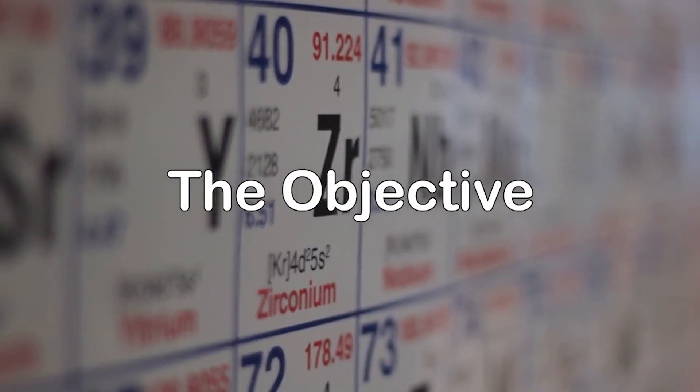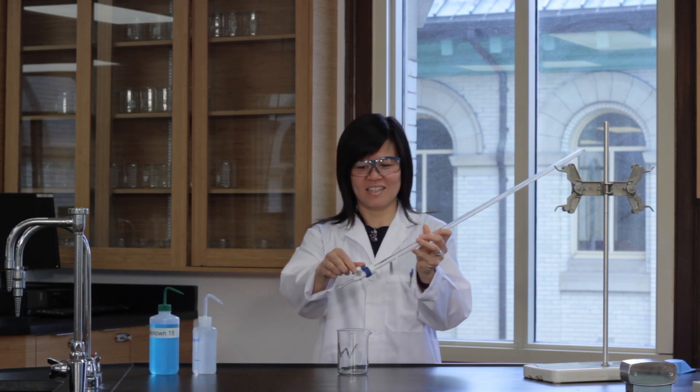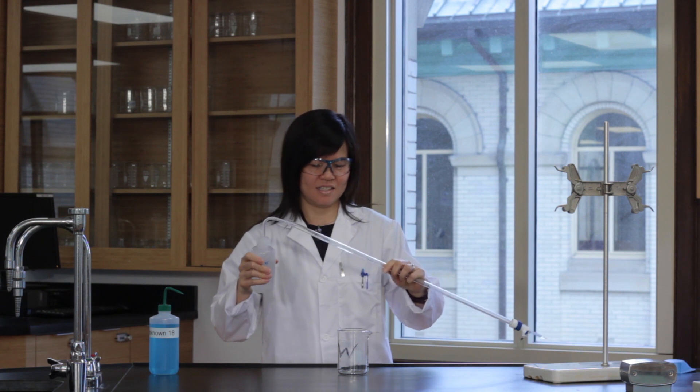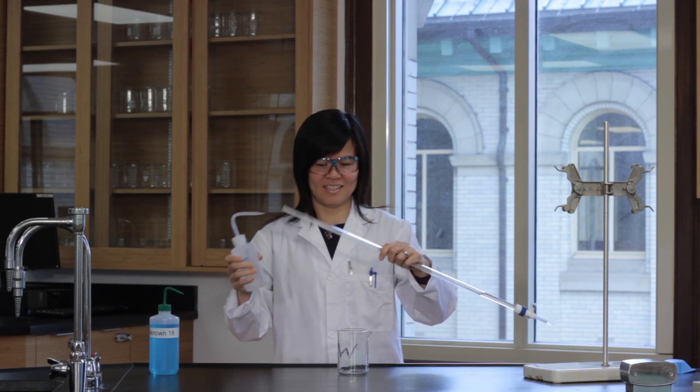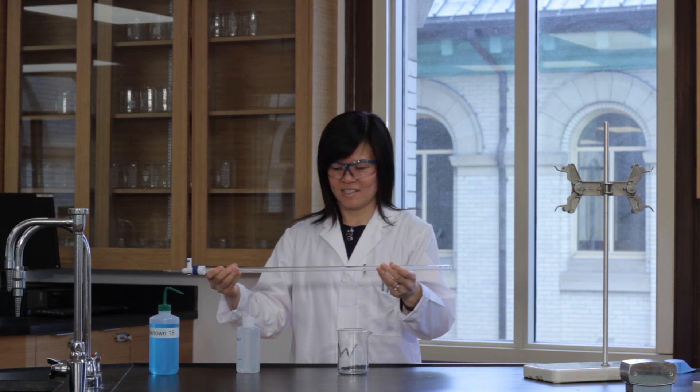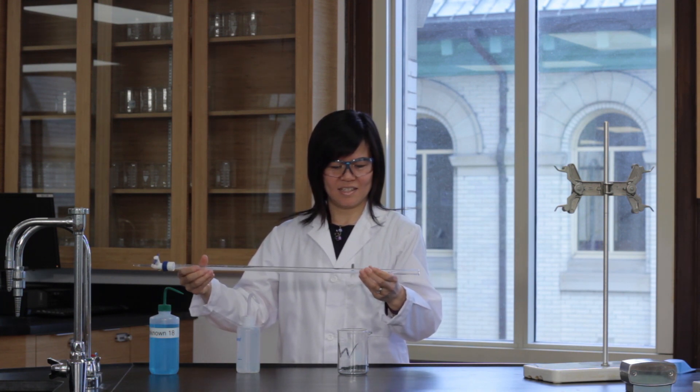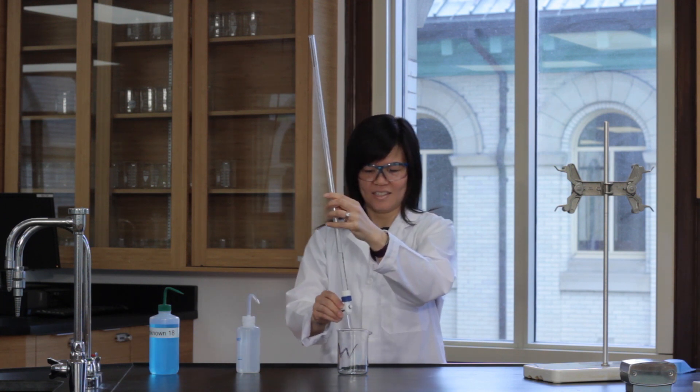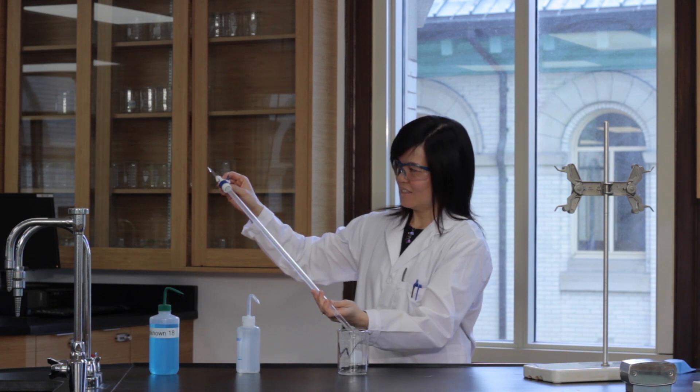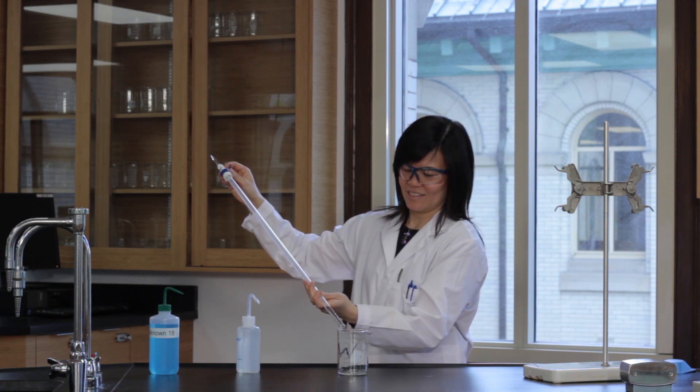Preparation of a burette. Rinse a burette with water and discard the rinsate, making sure to coat all of the inner surfaces with the water. Rinse the burette twice.